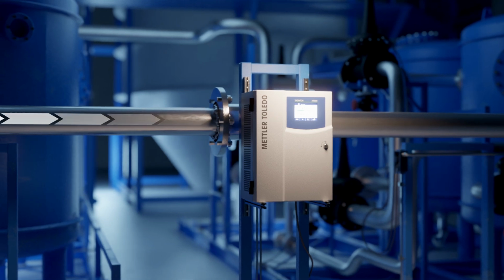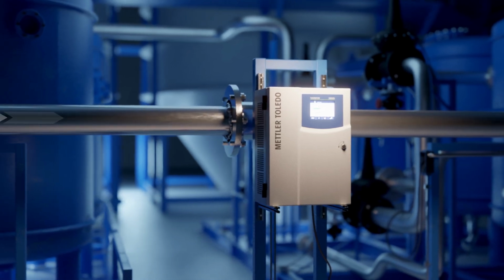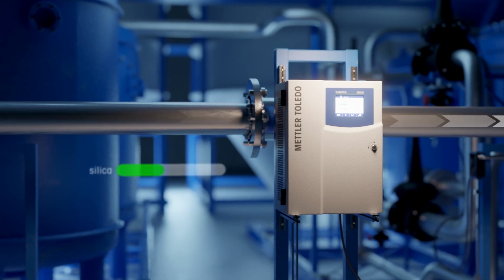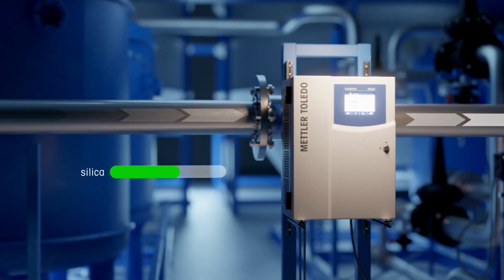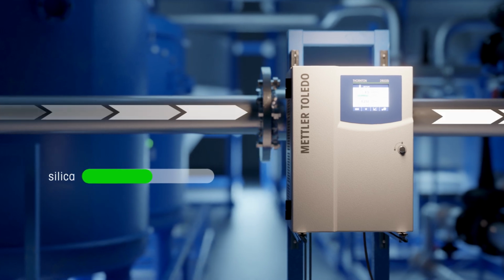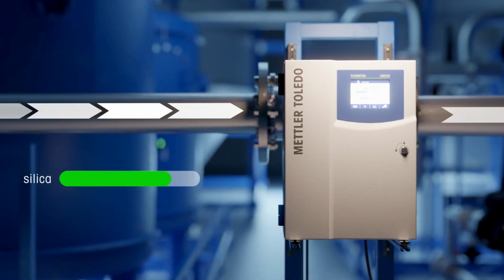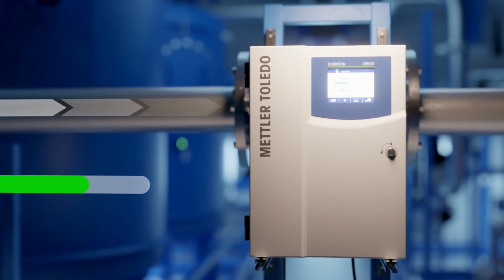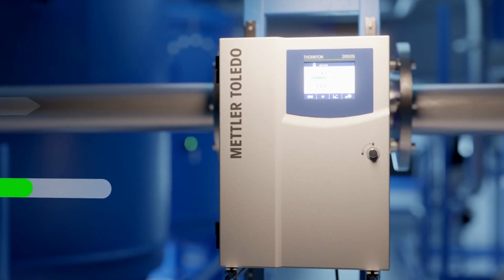To ensure only pure water reaches critical components, facilities must monitor the health of demineralizers with a focus on the silica level, as it is one of the first analytes released as resin approaches exhaustion. Continuous online monitoring of silica is a very effective tool for monitoring the health of demineralizers and troubleshooting systems experiencing short runs or high leakage.